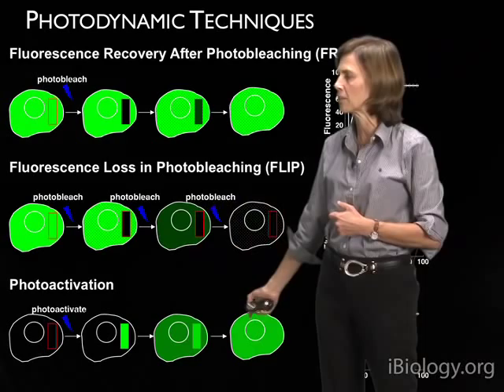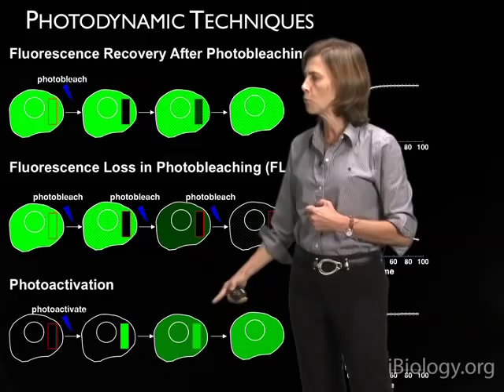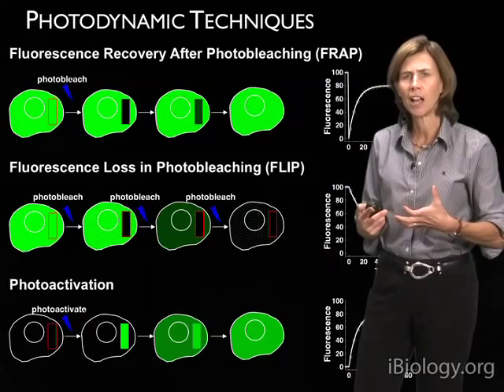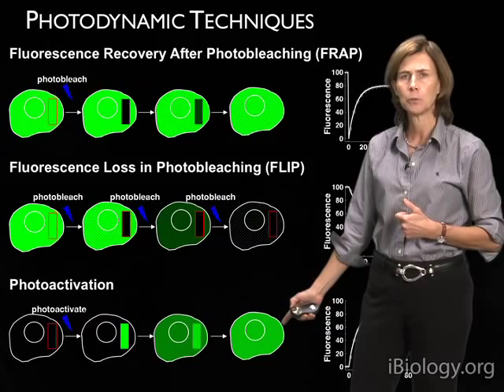And finally, with photoactivation, one has the ability to really harness both these strategies, but in addition, look at protein turnover, because after you photoactivate, no new proteins are being visualized except for the pool that you've highlighted at that moment in time. And so you can track, as in a pulse chase labeling experiment, the fate of these molecules.